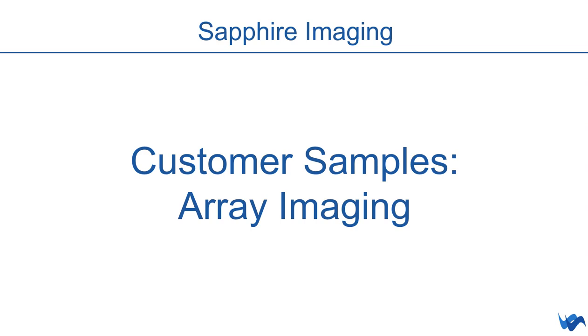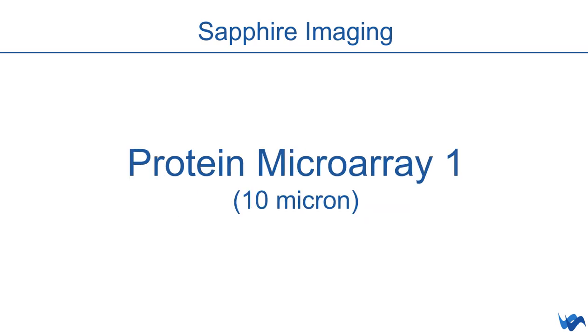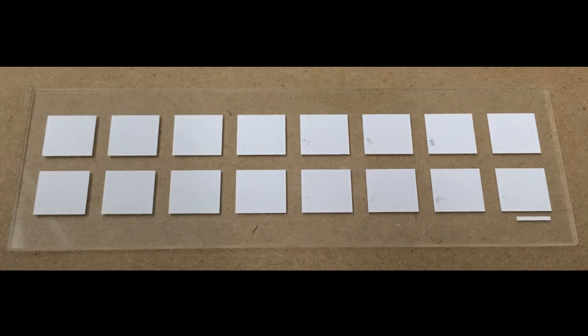The first images which I would like to show you are protein arrays. So indeed there's interest in the field on protein arrays, and I will give you an example. So this is a protein microarray which we put on the Azure glass surface. So the format is like a microscope slide, and we have scanned this here with 10 micron resolution, so full resolution.